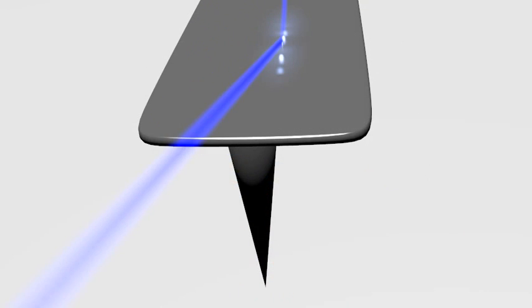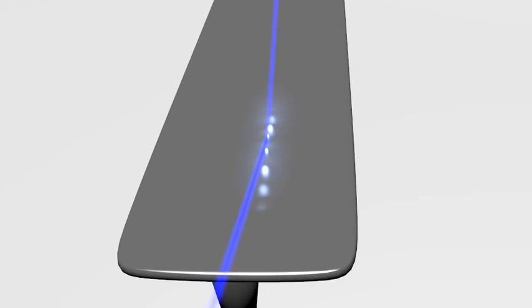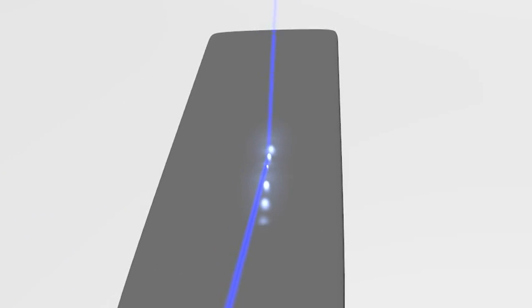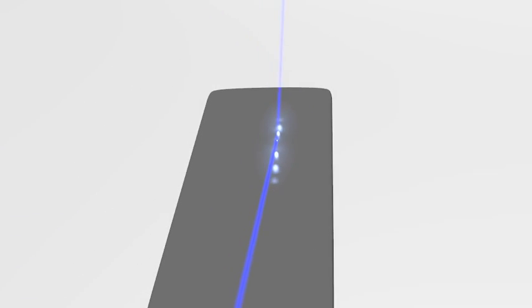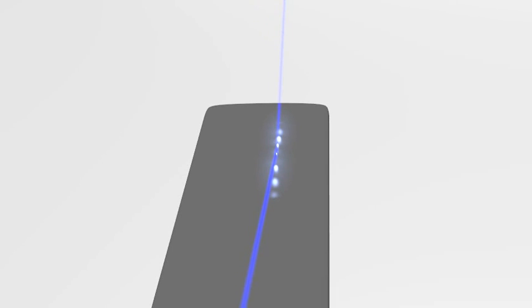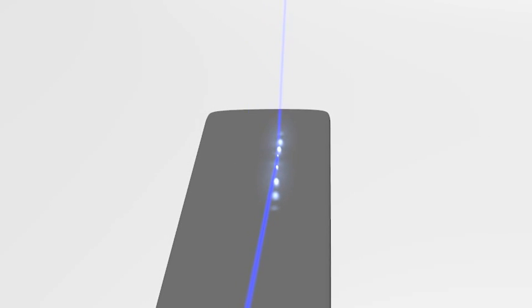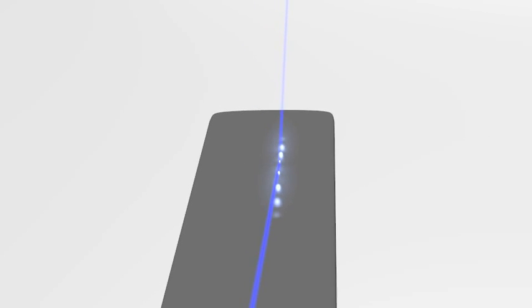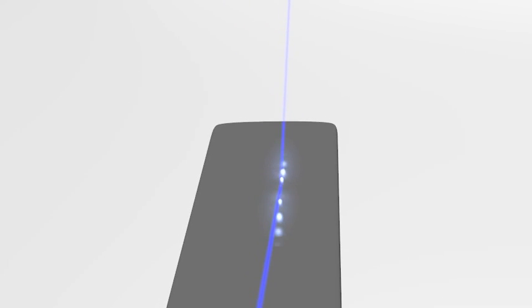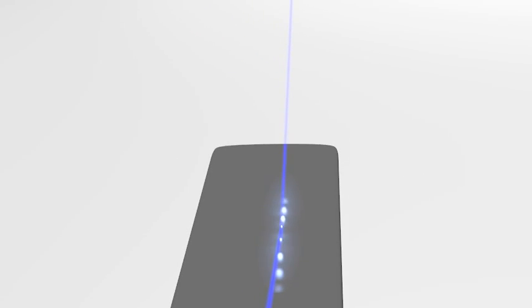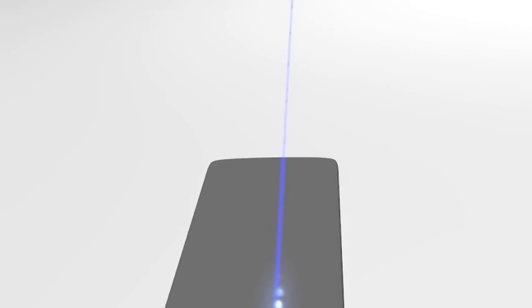An AFM tip is attached to a cantilever whose deflection in general is monitored by the change in reflection of a laser beam from the cantilever onto a photodiode.